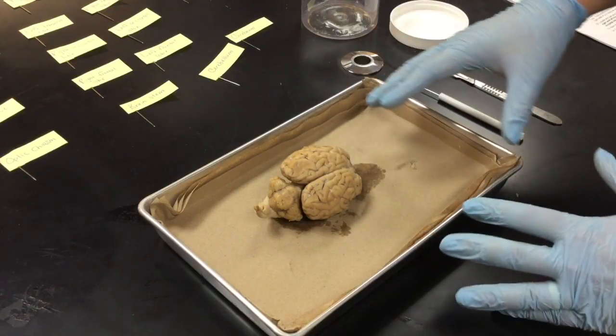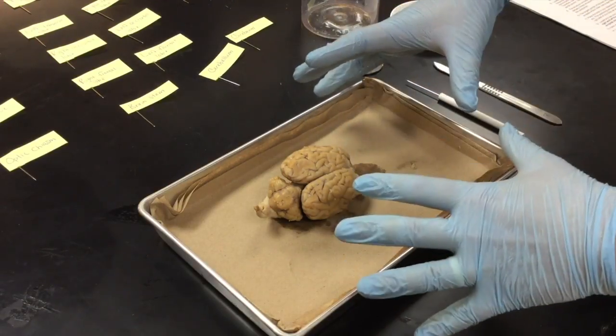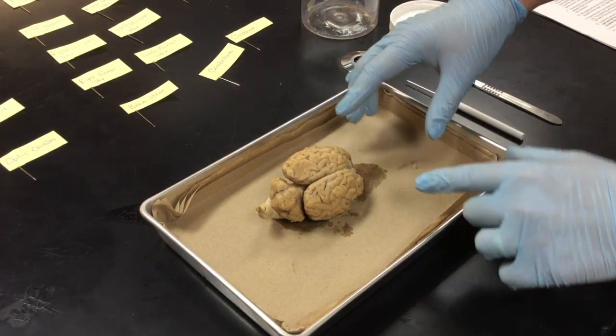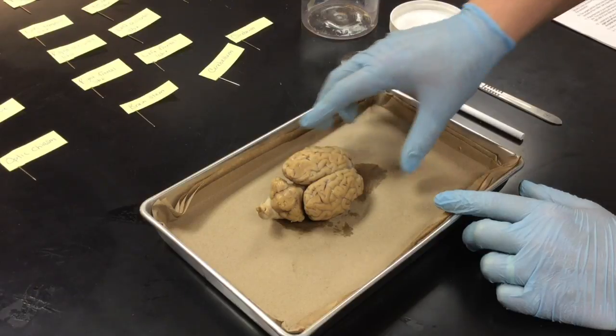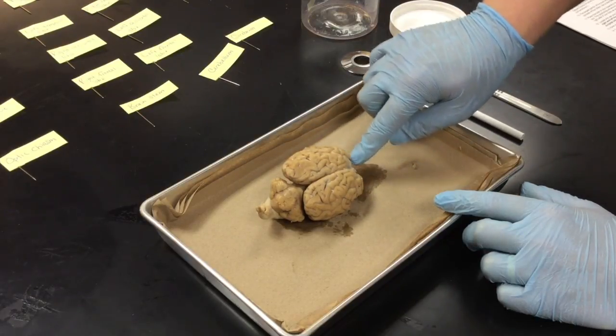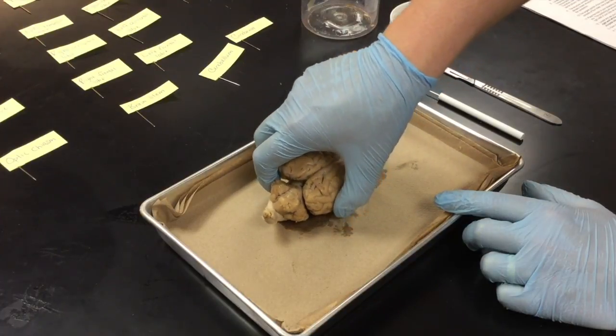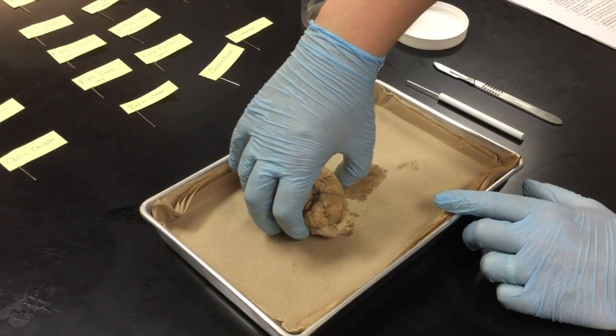So now we're going to start on the main dissection, or the main identification of the cerebrum within our brain. So we want to take the cerebrum and we want to take where the frontal lobes are located in the front part of the brain away from the brainstem. We want to point it facing away from us.